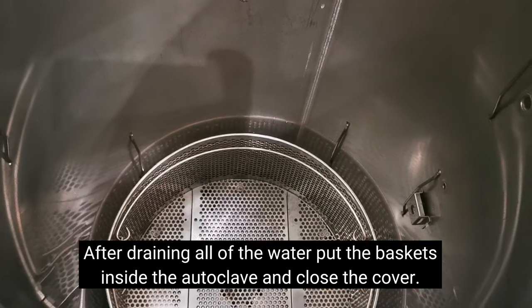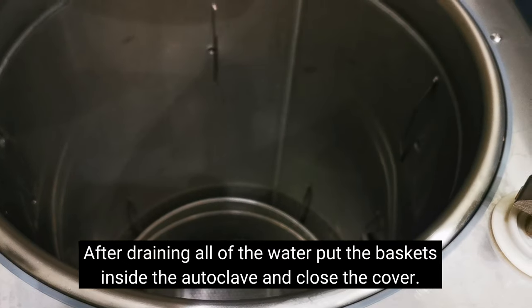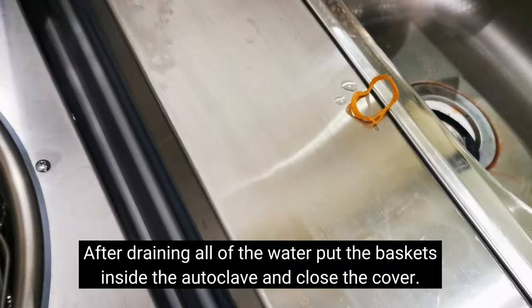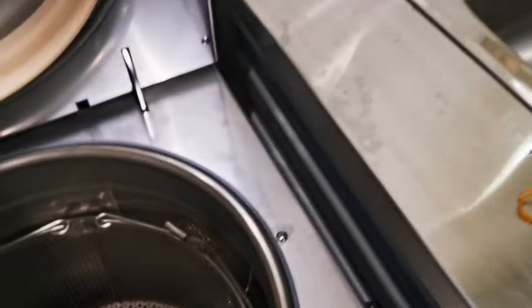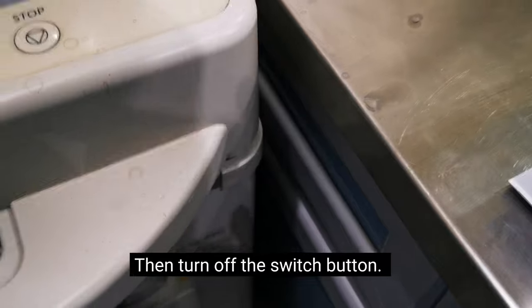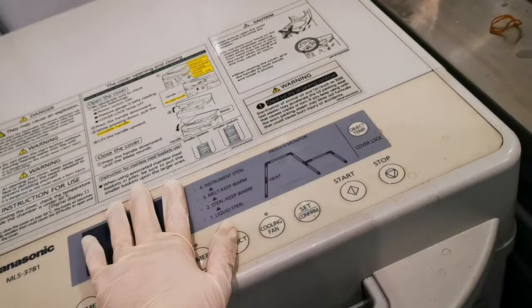After draining all the water, put back the two baskets we didn't use — take each basket and place it back the same way we removed them. That's the third basket. Now close the autoclave and turn it off — just press the switch down to turn it off. That's how you use this autoclave.